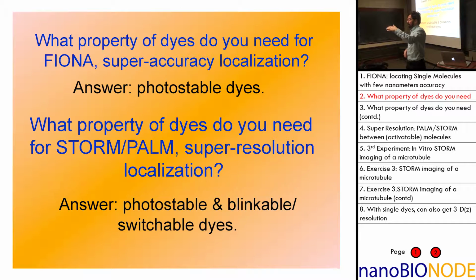However, some dyes, you can shine a strong light at it, and it will go into some other state that is not permanently photobleached, but goes to a dark state. And then you actually can shine a little bit of light, and then it'll come back.